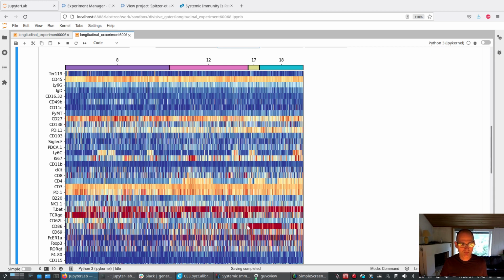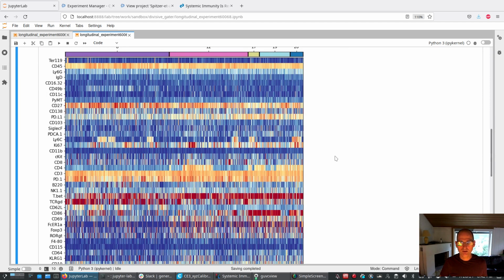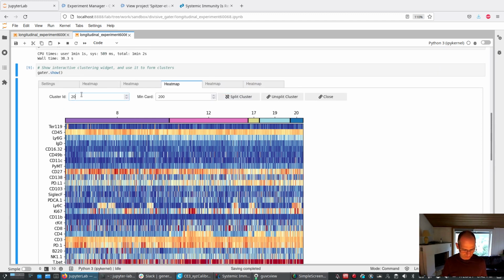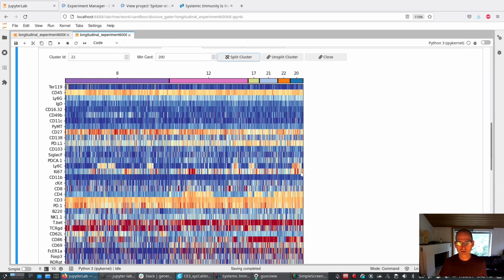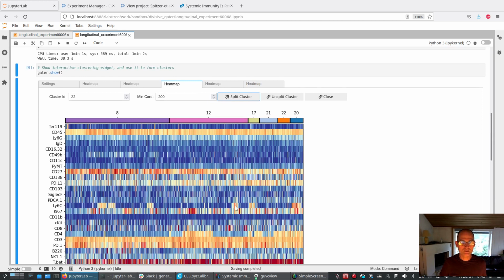Yeah, so now I got 1 in cluster 17, that's good. I go on, split up cluster 18, 19, 20. Yeah, it seems that cluster 20 still, no, cluster 19 still needs to be split. So let's try to do 19. Split. Yeah, now I'm good. Now I have the CD86 negative ones in cluster 22. And yeah, cluster 20 is a little mixed, but I think I'll go with this.